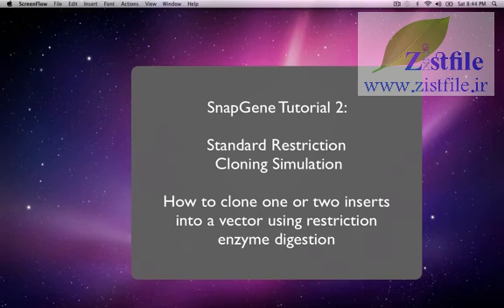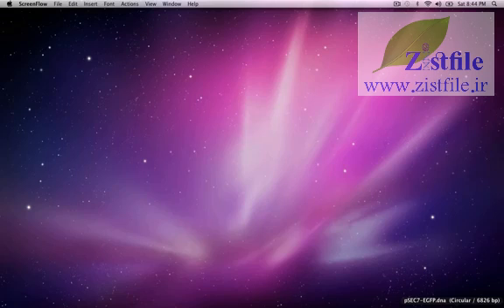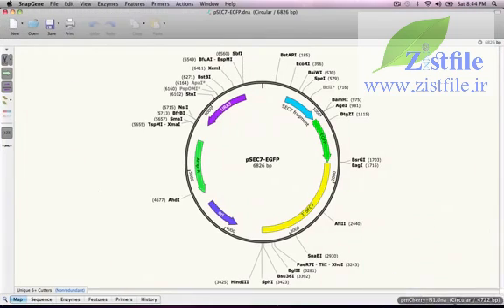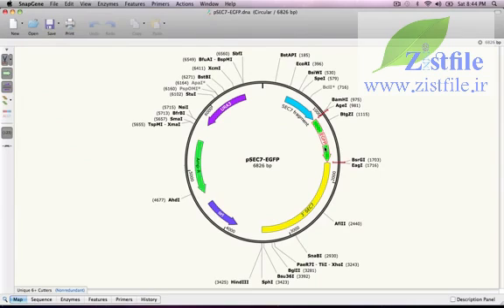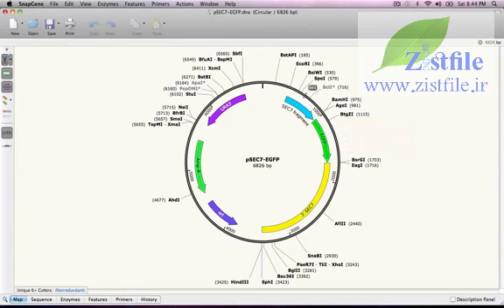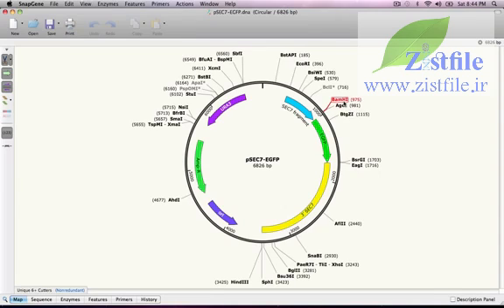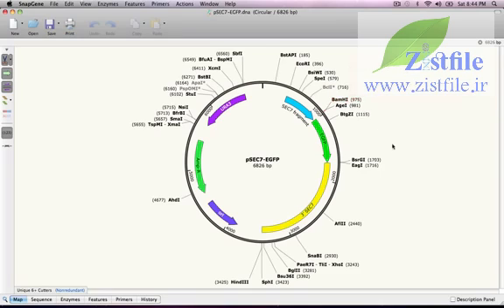I have a plasmid called PSEC7-EGFP in which the gene for enhanced GFP, EGFP, is fused downstream of a portion of the yeast SEC7 gene. My goal is to replace EGFP with a gene encoding the red fluorescent protein, MCHERRY.